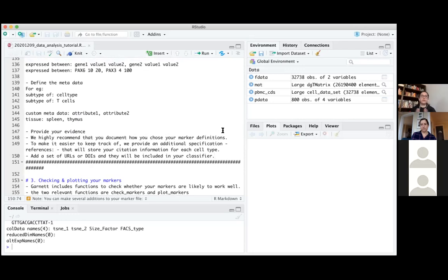Suppose in this case, expressed between 10 and 20. It's possible that you're giving the low threshold for this gene as 10 and the higher threshold as 20, because you have 3 different runs that say that it's expressed 8, 12, and 14. So you just want to give it a range. Okay, that makes sense. Thanks.